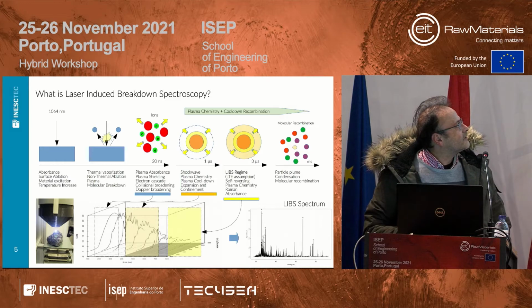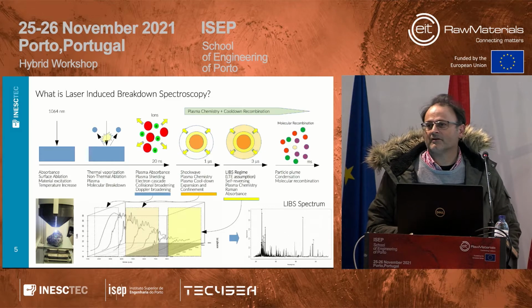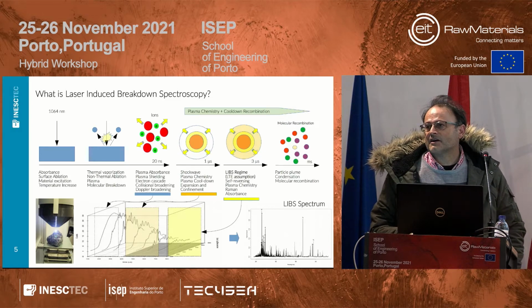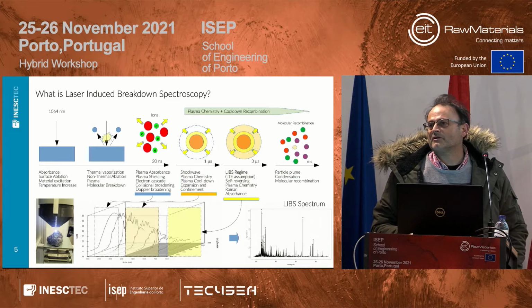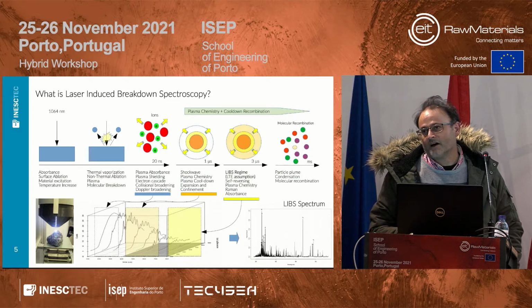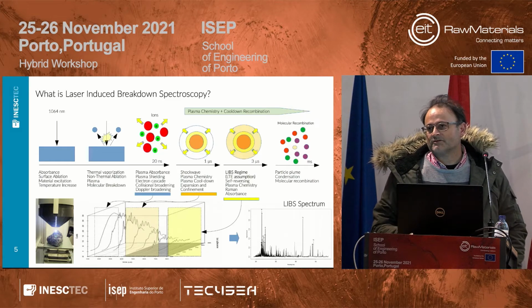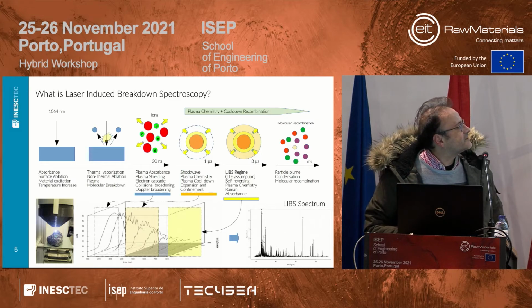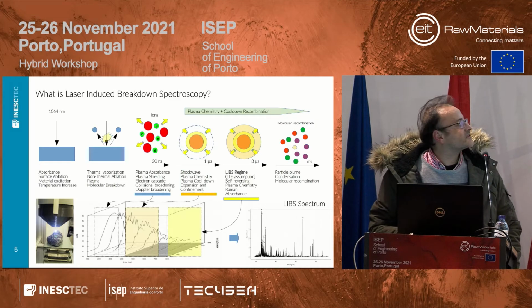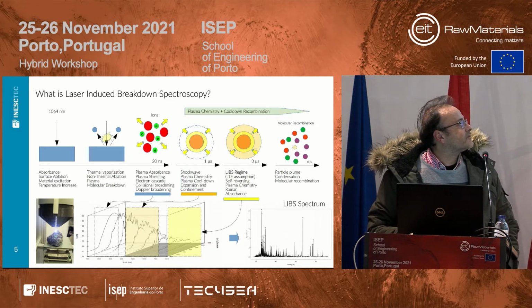After breaking down the molecular bonds, the free ions can be simpler ions, like small molecular ions, and as the sample keeps heating, you are left with only elemental ions and electrons. This is the main plasma that is formed. This plasma can have different temperatures and concentrations, and very different phenomena can occur.